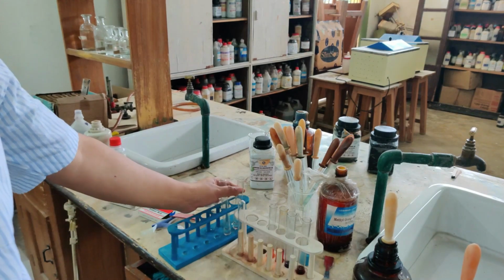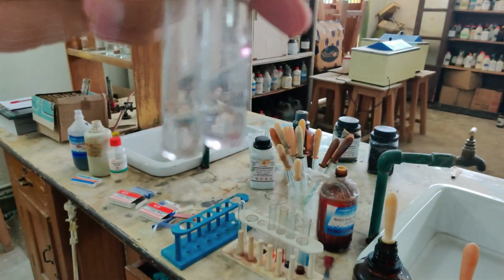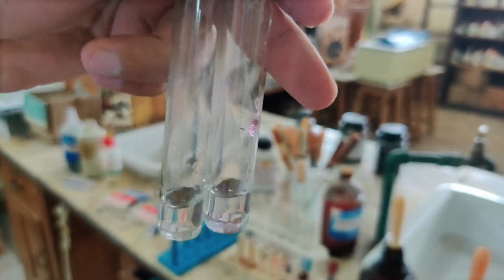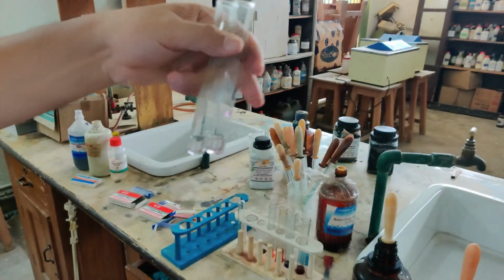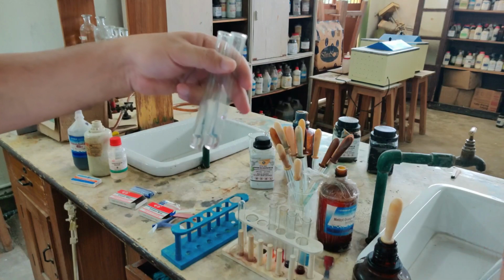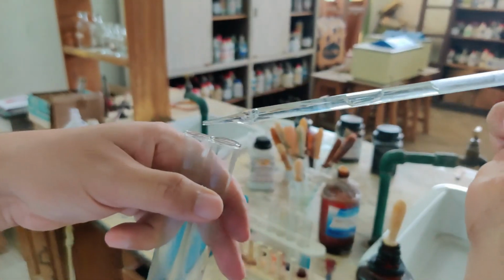Now let me take these two test tubes. Both these test tubes contain phenolphthalein. Now you can see phenolphthalein is colorless, it looks like water. Now I am going to test this with acid as well as base. Now let me put base in the first one. First let me test with acid. You know, phenolphthalein will not change its color if you are adding an acid. So in the first test tube I am putting an acid.